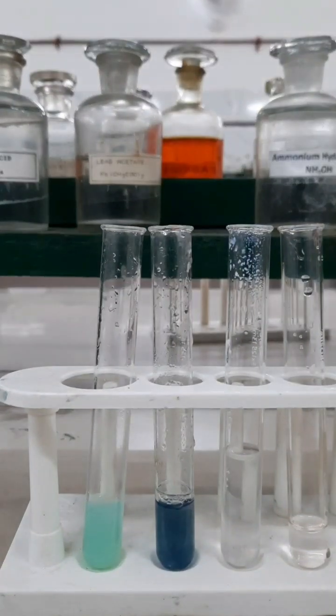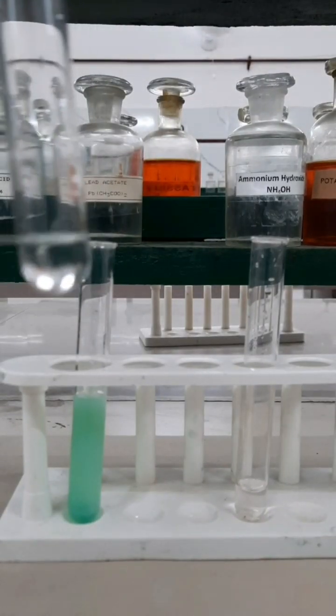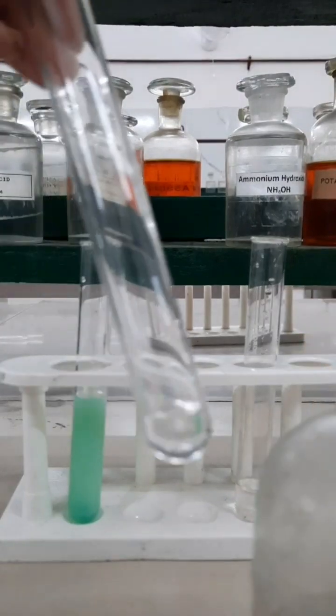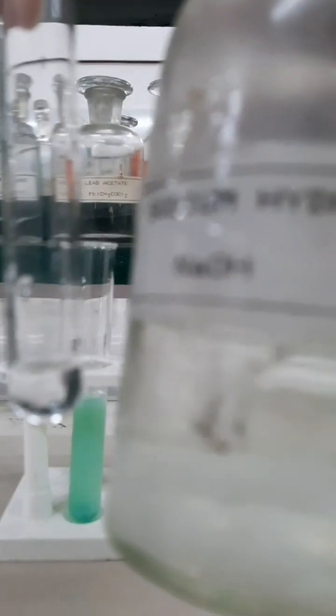Now in the third test tube I have taken zinc ion. Here it is the aqueous solution of zinc sulfate and now I am adding sodium hydroxide solution into it.